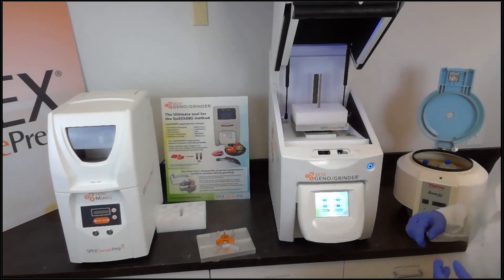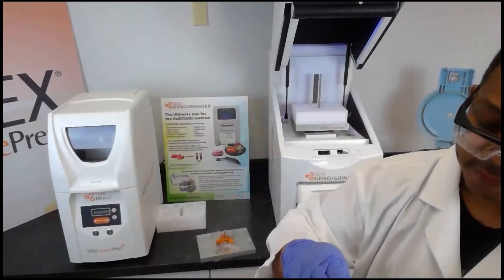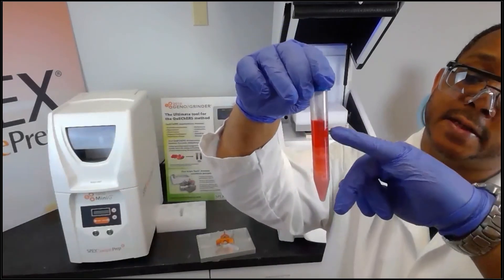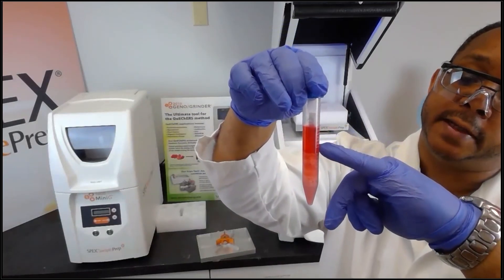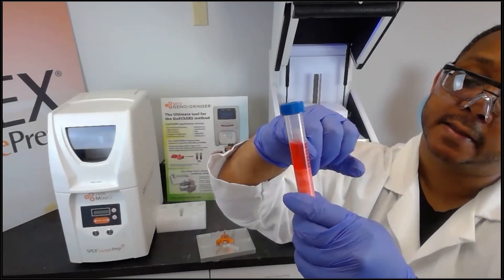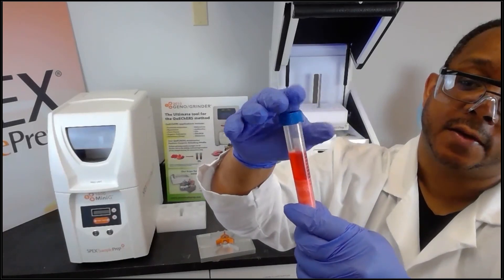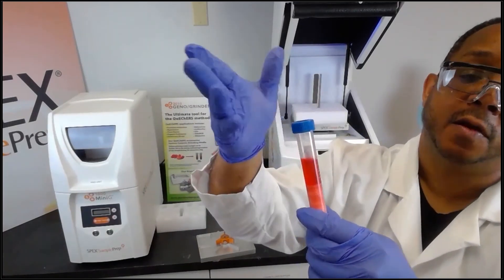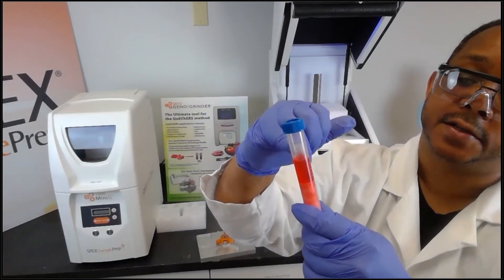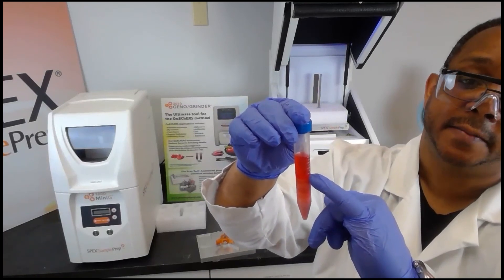Here I have a sample that has already been prepared and centrifuged. You can see the strawberry sample and how the solid layer has been further separated from the liquid layer. We want to extract the liquid layer for analysis by GC-MS or LC-MS. Depending on which method you use, you may need to dilute the sample based on the concentration of the pesticides present.